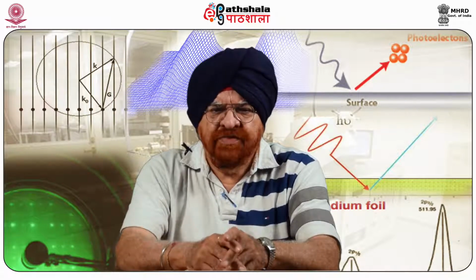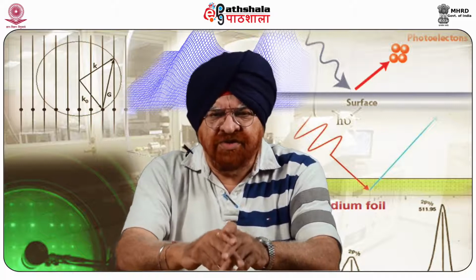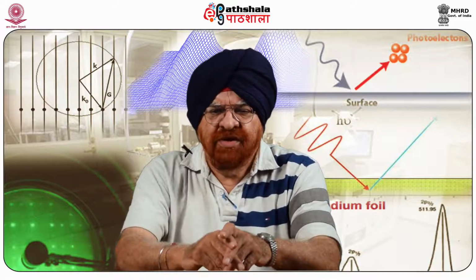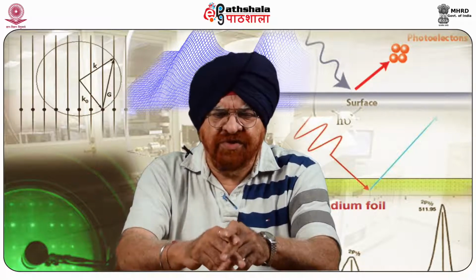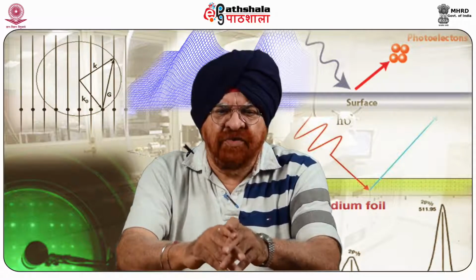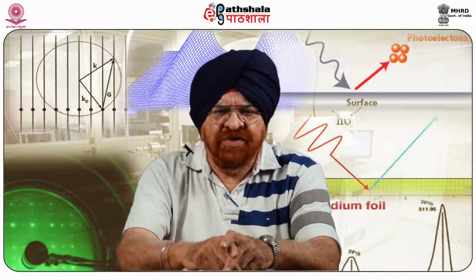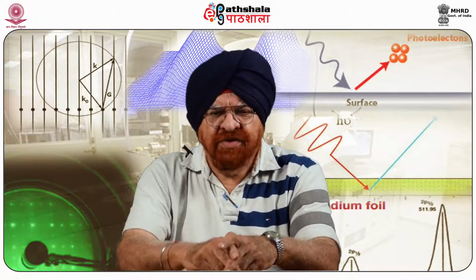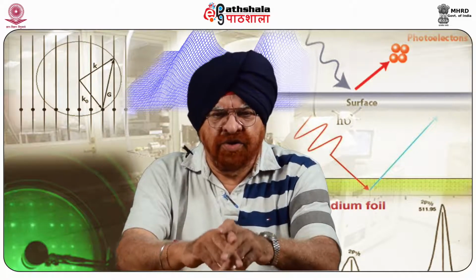With KPFM, the work function of surfaces can be observed at atomic or molecular scales. That means we can go to a very low atomic level at these surfaces. The work function relates to many surface phenomena, including catalytic activity, reconstruction of surfaces, doping and band bending of semiconductors, charge trapping in dielectrics, and of course corrosion.